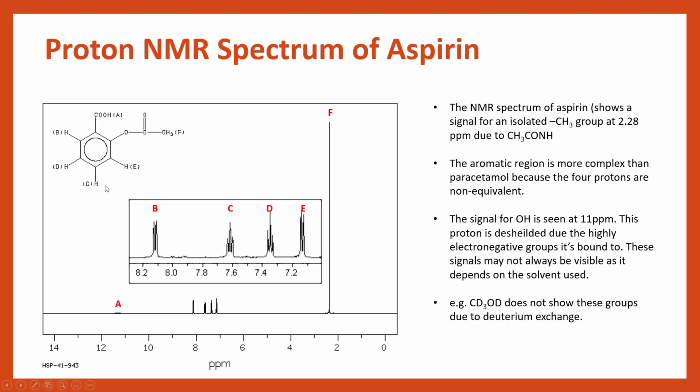This is also beside two hydrogens, but those two hydrogens are already influenced by different chemical environments, so this, again, is going to be by itself. And the same here, this hydrogen is beside a carbon, a C single bond O group, and a CH. So again, it's going to be by itself. All of their chemical environments are different.